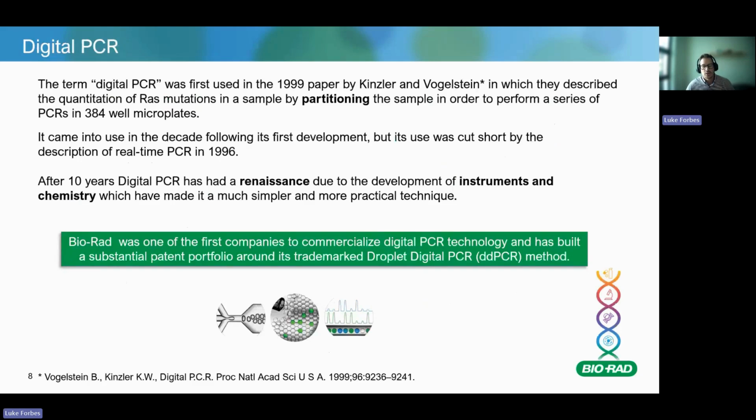So if you think about what we discussed in that slide, you might think, well, obviously ddPCR is kind of the logical approach. It takes what's best in real-time PCR, which is the fluorescent dye used for quantification, as well as what's best in conventional PCR, which is your endpoint detection method, which obviously reduces the effects of inhibition and reaction efficiency is not so important.